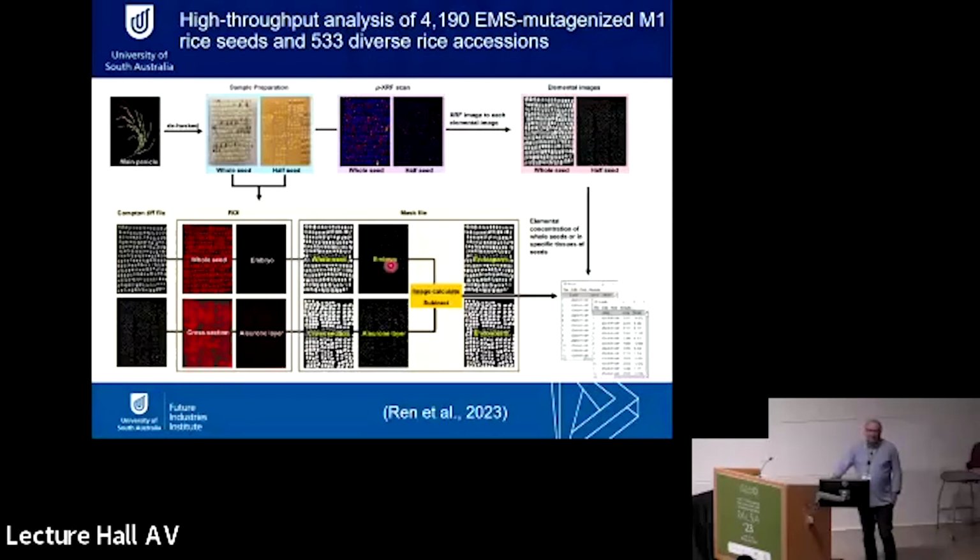There are maybe 12 steps to do, but it takes basically half an hour to extract the data from about 500 seeds. Now we have a Python pipeline that really can be used and just gives you the results basically straight away.